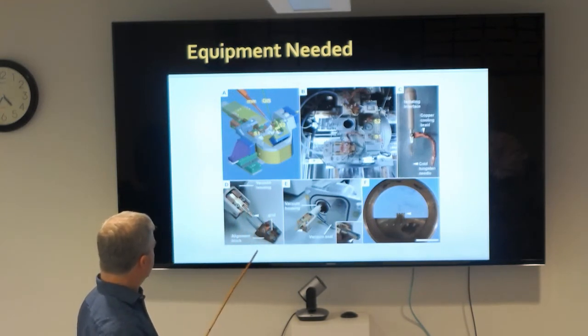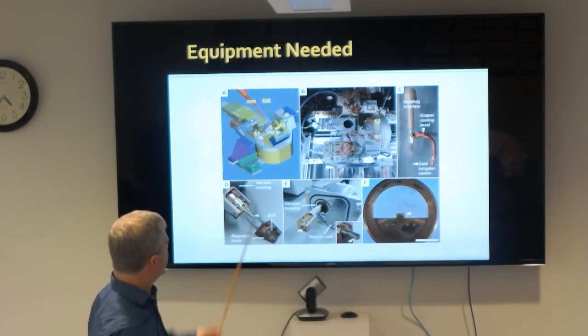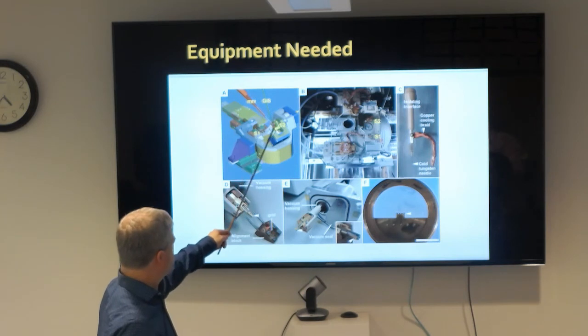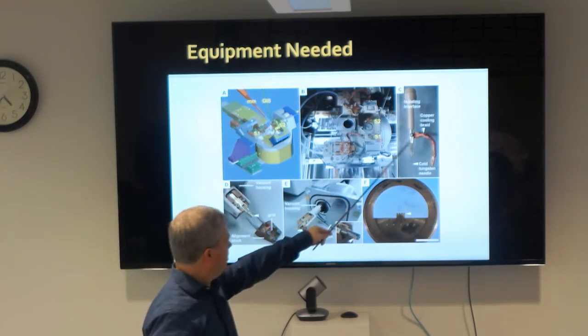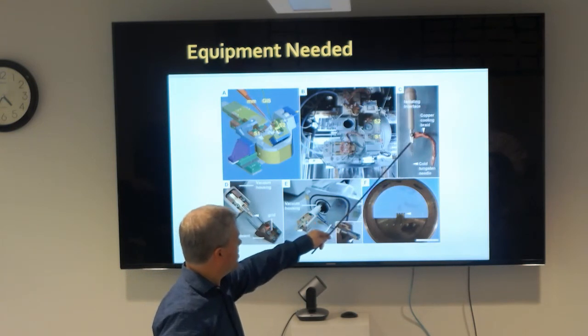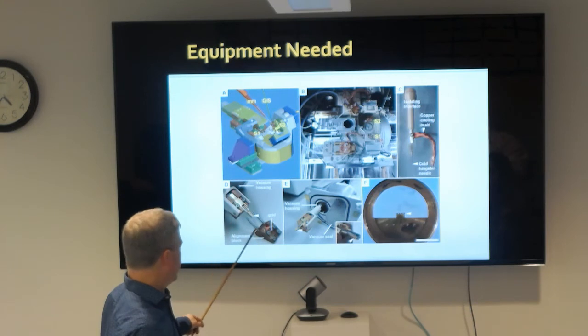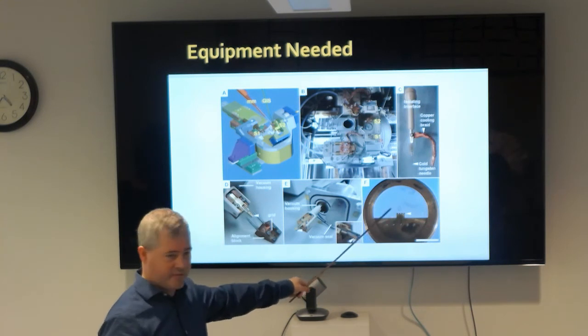They needed a cooled micromanipulator, a gas injected device to glue it on when it's cold. You need a special copper cooling braid to cool a micromanipulator. It's a lot of equipment to get it to work. And then you put it onto these half grids where you can stick it on there.